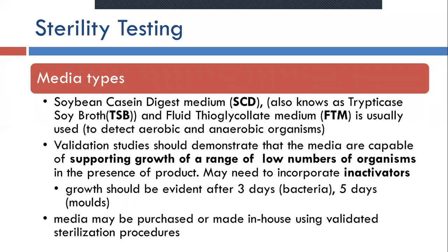And the next one is the media type. This is another important factor because, as I told you earlier, if any microorganisms are remaining in an unsterilized product, these organisms will be very, very few in number and they will be under shock because they have gone through a very serious, severe process of sterilization. So even though they are alive, their recovery rate will be very, very low. That's why the media we use should be such that it helps these organisms to grow back.